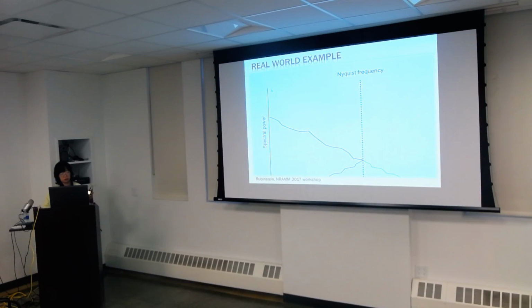So in a real-world example, let's say I have something where, as described in James' lecture, the Nyquist frequency is the highest frequency you can describe with your pixel detector, for example. You have a Nyquist frequency, and then you have signal going beyond it, which in this case is just a monotonic decrease of my signal. So I have some more signal that's outside Nyquist. But the detector can only get you to Nyquist, so where is that information going to go? When I'm fitting to describe what is going on, what normally happens is that it's folding back. That's the picture that I showed on the title slide.